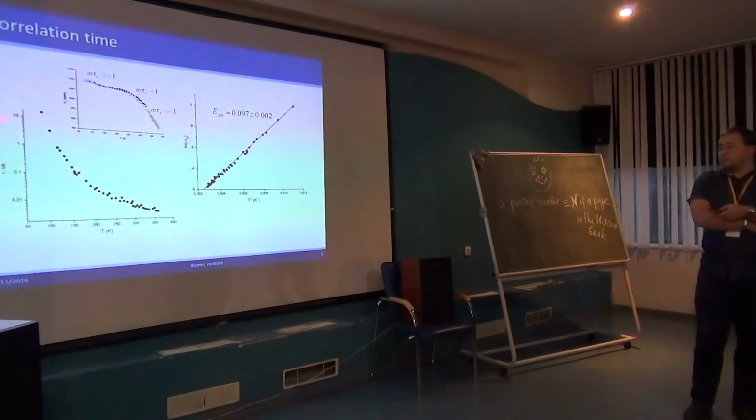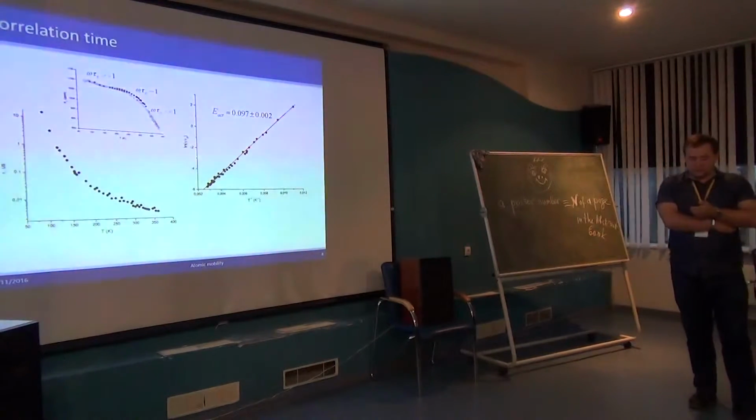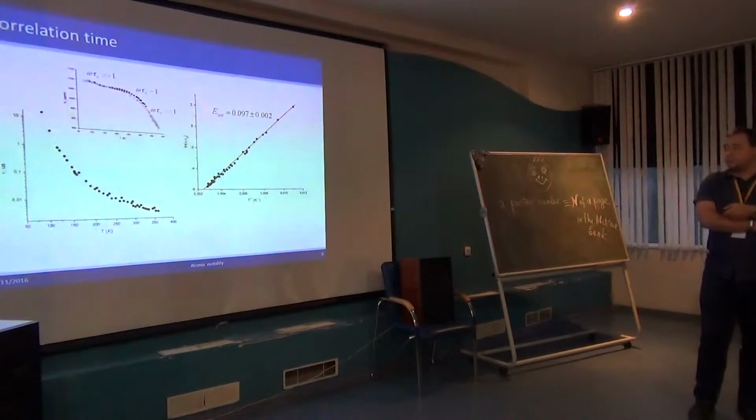On this plot, you could see the dependence of correlation time on temperature, and using the Arrhenius plot, we could obtain another important value, the activation energy of such atomic motion. Actually, this value is quite close to the activation energy in liquid bulk sodium.